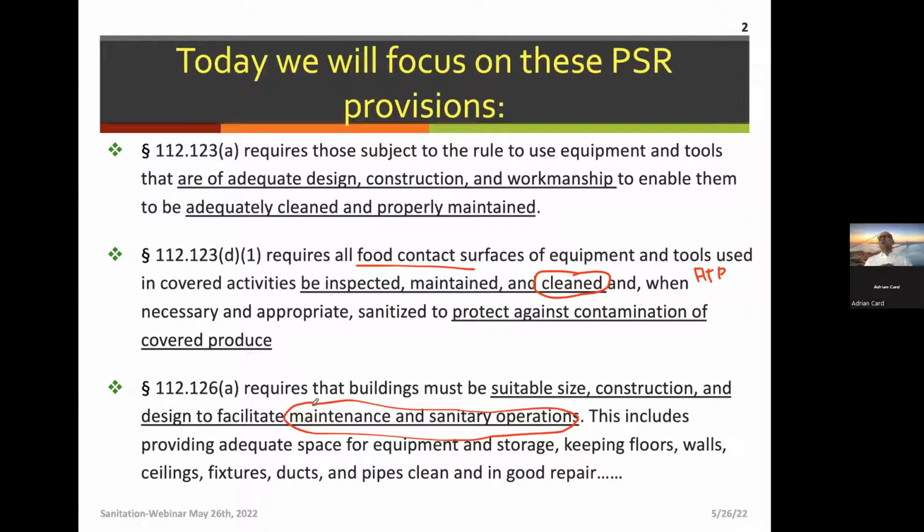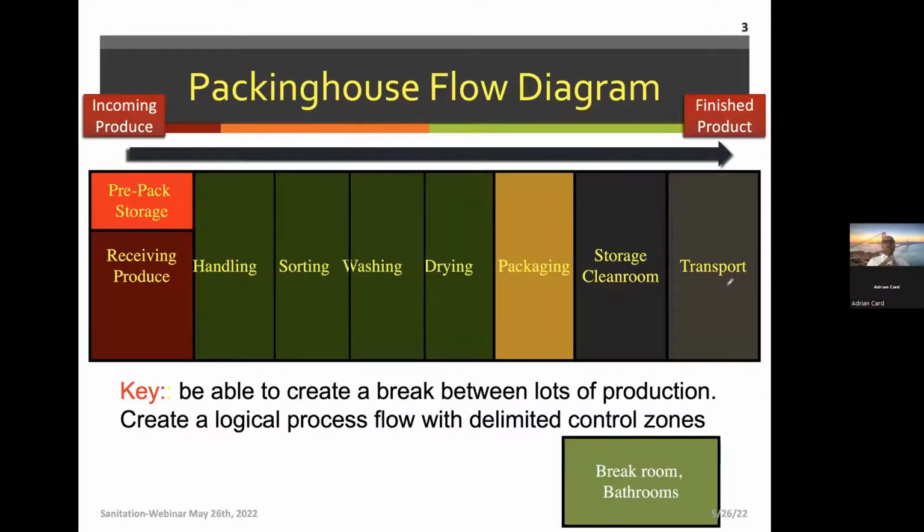Of course, there are some operations that are also considered facilities. What I mean by that is that they also have to meet the preventive controls for human food. And in those areas, the way it's tied is because with preventive controls for human food, environmental monitoring becomes an important aspect in the system. And ATP, besides microbiological testing, could be an important tool within the environmental monitoring plan.